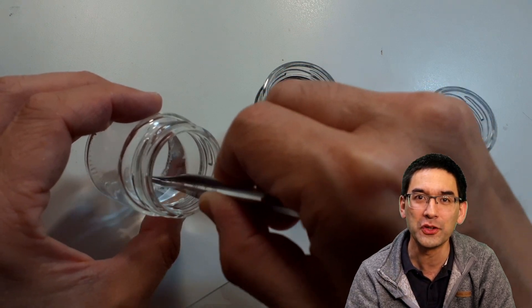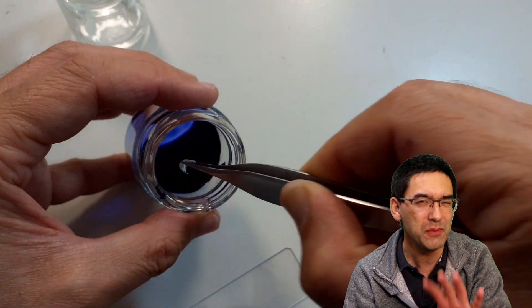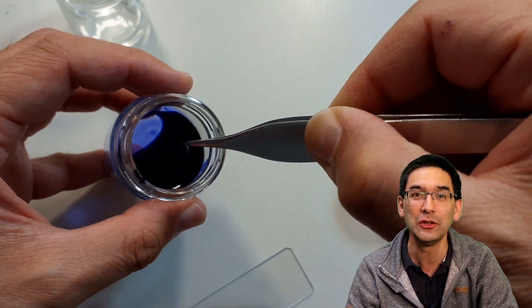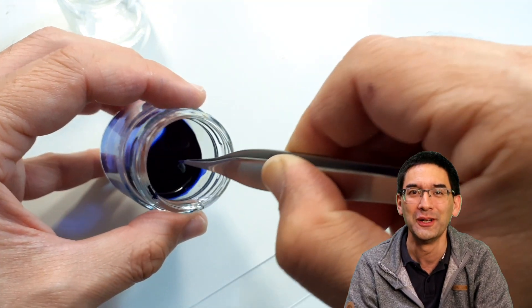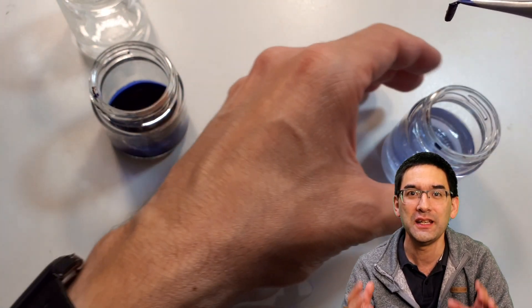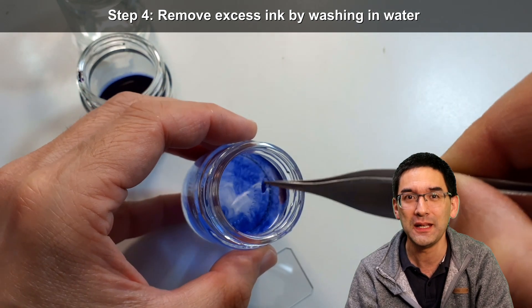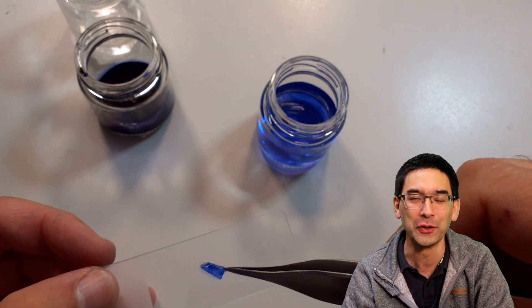Don't let go with the tweezers, otherwise you're going to have a problem finding it again. Then it goes for about 10 or 15 seconds into the blue ink. The alcohol removes the water from the cells, and when you place it into the ink, the ink is able to enter the cells. That's why alcohol is so important — otherwise the ink won't go into the cells. It's very blue and too much ink probably, so you quickly and briefly rinse it for a very short time in clear water. Don't overdo that, because otherwise the ink is going to be gone again.